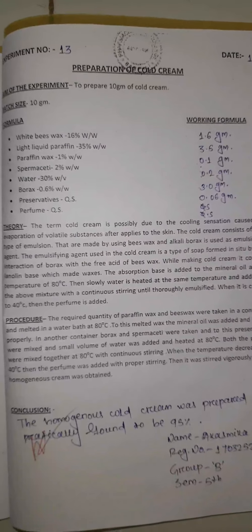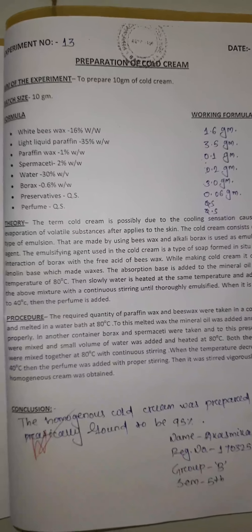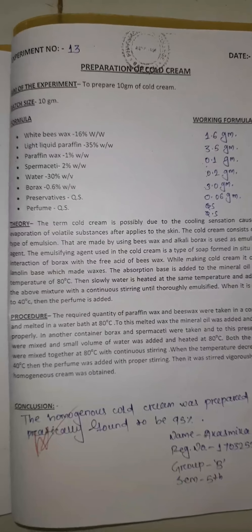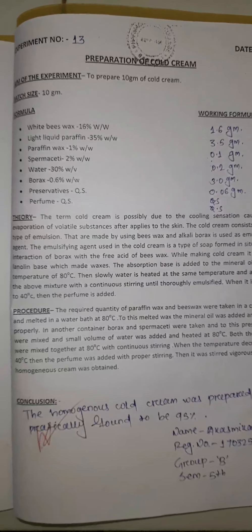Today's practical is for fifth semester industrial pharmacy. The practical is preparation of cold cream. The aim of the experiment is to prepare 10 grams of cold cream. The batch size is 10 grams.